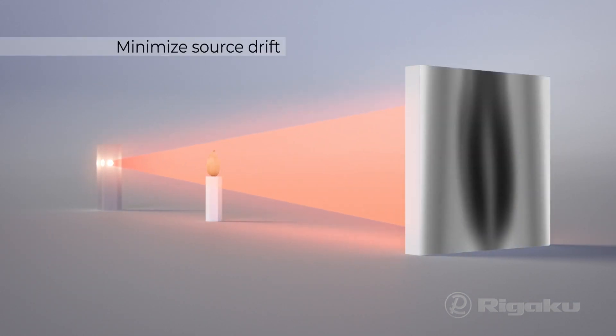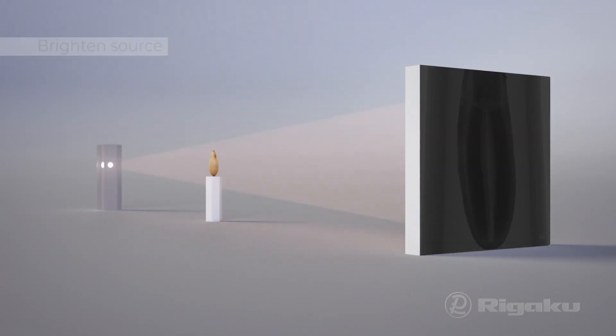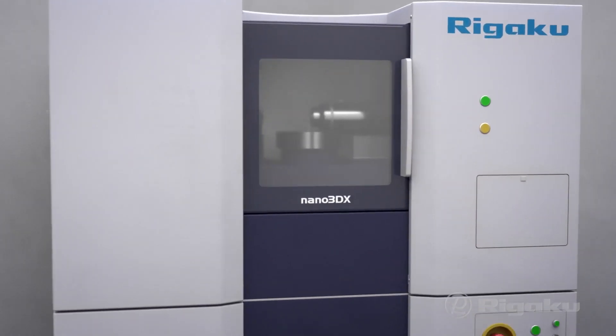You also need to minimize drift of the X-ray source for best resolution and brighten the source for high-speed scans. Nano 3DX does all this and more.